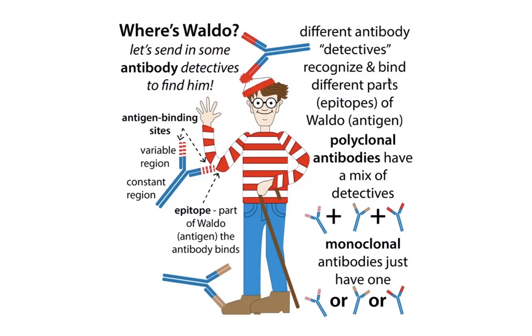I like to think of antibodies as kind of a biochemical version of Where's Waldo, where basically you have these little proteins that are able to go search for specific unique qualities of a specific protein, or it doesn't have to be a protein, but some sort of thing that this antibody recognizes. And when we say recognize, really all that it means is that that antibody is going to bind, hopefully very specifically, to something. And we'll talk a little bit more about how this actually occurs. But basically, there are parts of the antibody that are kind of generic for the animal that makes it. And then there are also these variable regions, and these variable regions are going to be the parts that actually bind to the thing that it, quote unquote, recognizes.